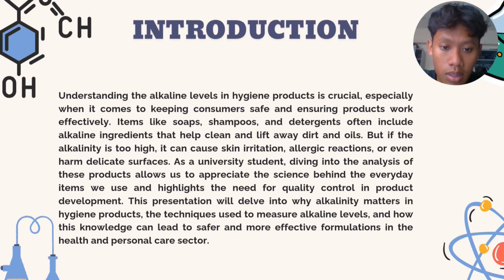As a university student, diving into the analysis of these products allows us to appreciate the science behind the everyday items we use and highlights the need for quality control in product development. This presentation will delve into why alkalinity matters in hygiene products, the techniques used to measure alkaline levels, and how this knowledge can lead to safer and more effective formulation in the health and personal care sector.